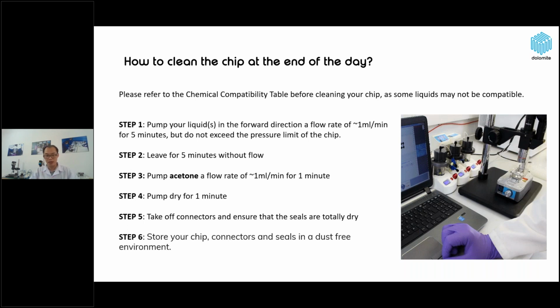stop the pumping and leave it for 5 minutes without flow. The purpose of this step is to give enough time for the solvent to dissolve all of the contaminants or ingredients from your experiment that remained after your experiment.